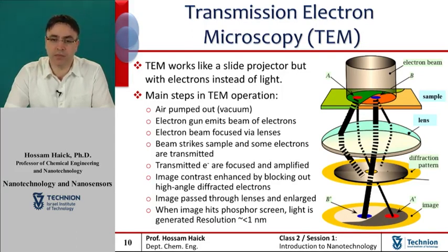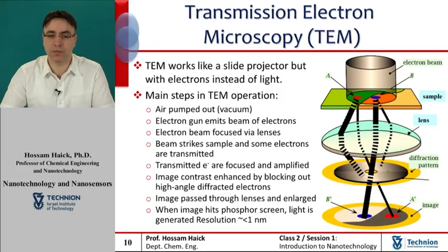Many materials require extensive sample preparation to produce a sample thin enough to be electron transparent, which makes the TEM analysis a relatively time-consuming process with a low throughput of samples. The structure of the sample may also be changed during the preparation process.